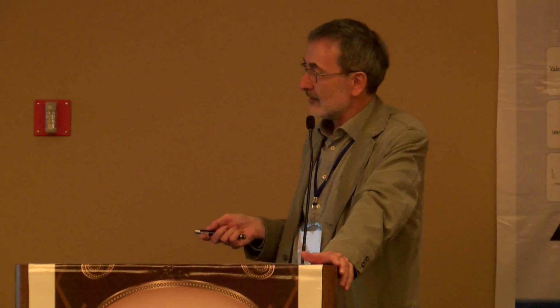And this is a typical dead nematode. This is not curled. It's a straight dead nematode, and by using laser desorption mass spectrometric imaging, we could detect these compounds within the lipid droplets. The lipids have been detected by Raman spectroscopy, just to mention that it is really a lipid droplet within the nematode.